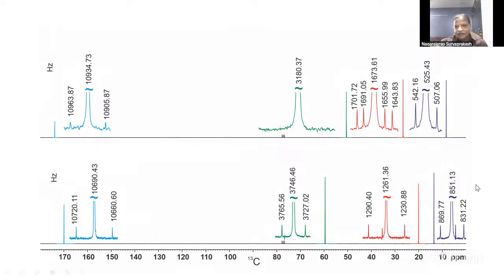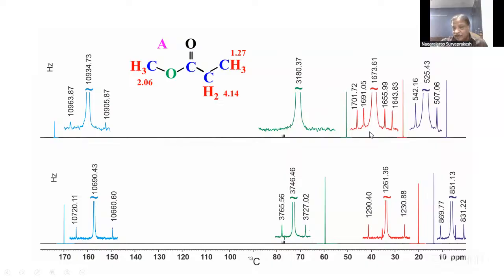Look at it here. Here, 1 doublet. Here, 1 doublet. And here you see, this carbon has 2 doublets. Obviously, I would say this is this carbon. It is coupled to this and this. 2 carbon 13 doublet satellites you are seeing. This is called carbon 13 satellites in the carbon 13 spectrum. Whereas, here and here you get only 1 doublet.